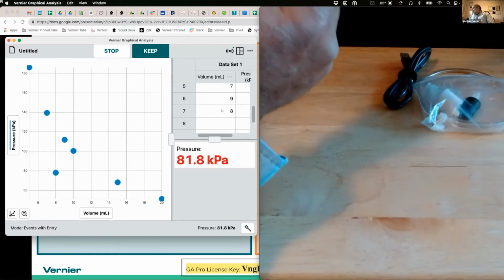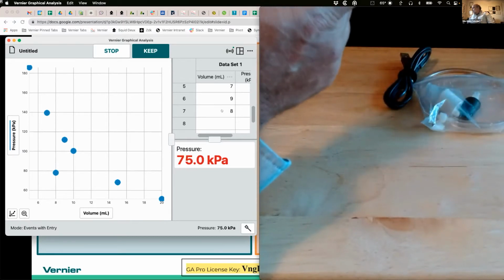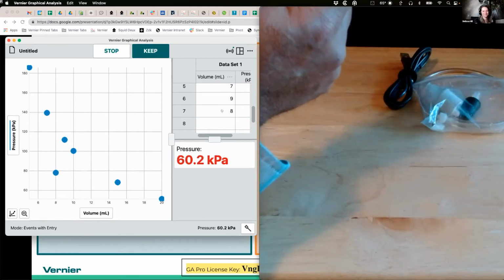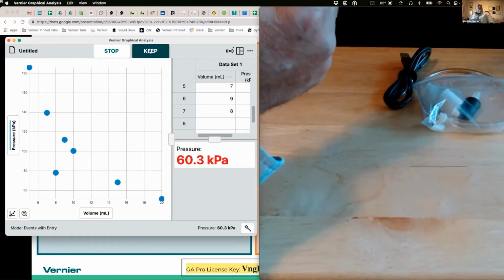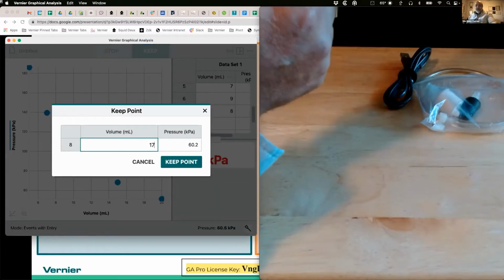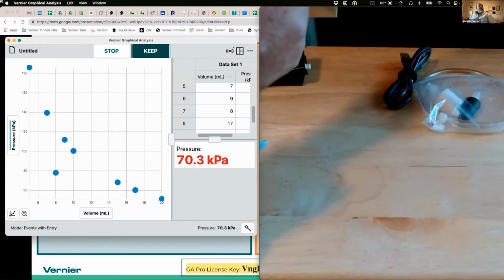Oh, you know why? I was doing 13 and I typed in 8. Perfect. Keep that in mind. I'll do one more. I'll do 17. Good example. That's a good example of boo-boos. And unless your students are perfect, I'm sure all your students are perfect, they're going to make a mistake.